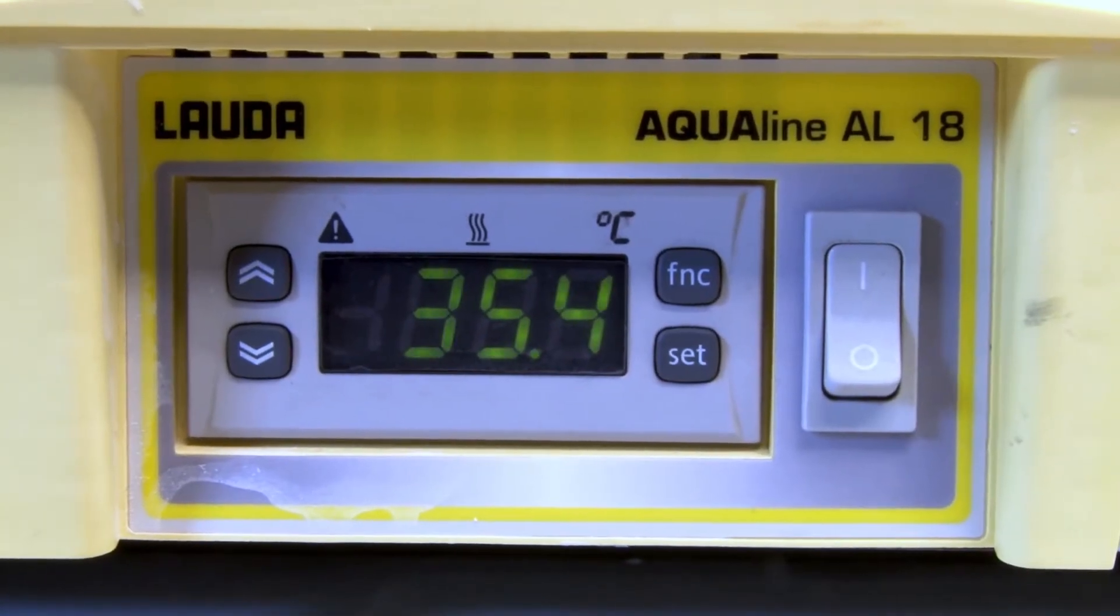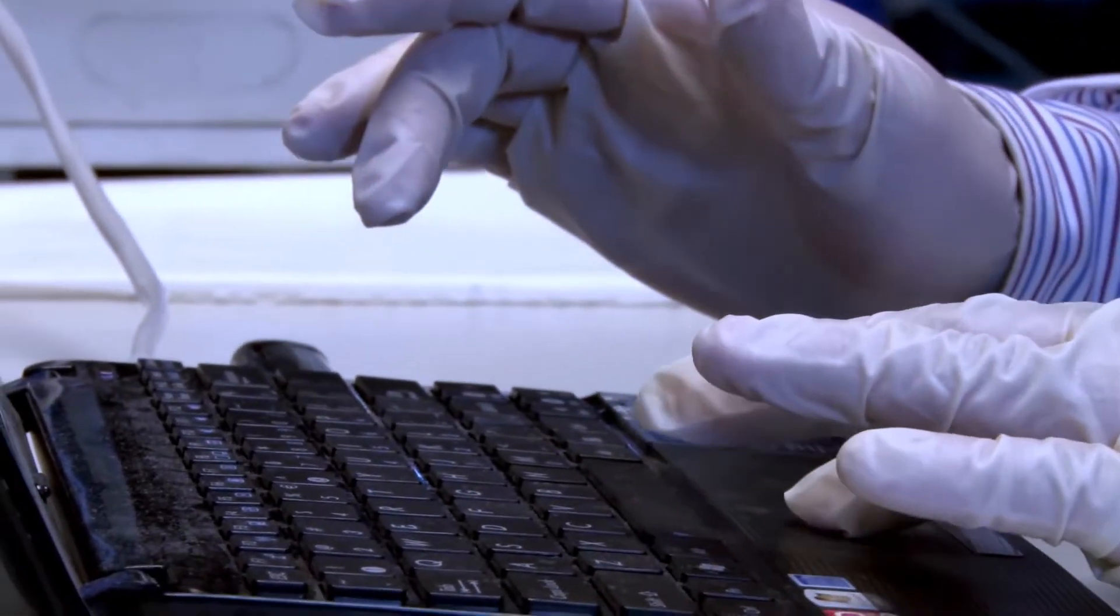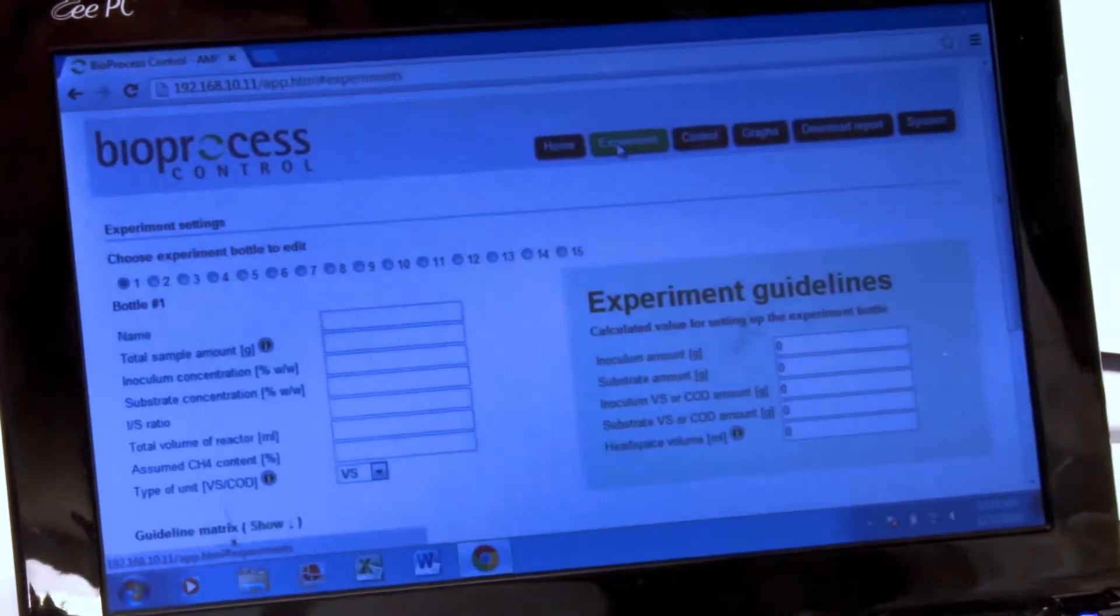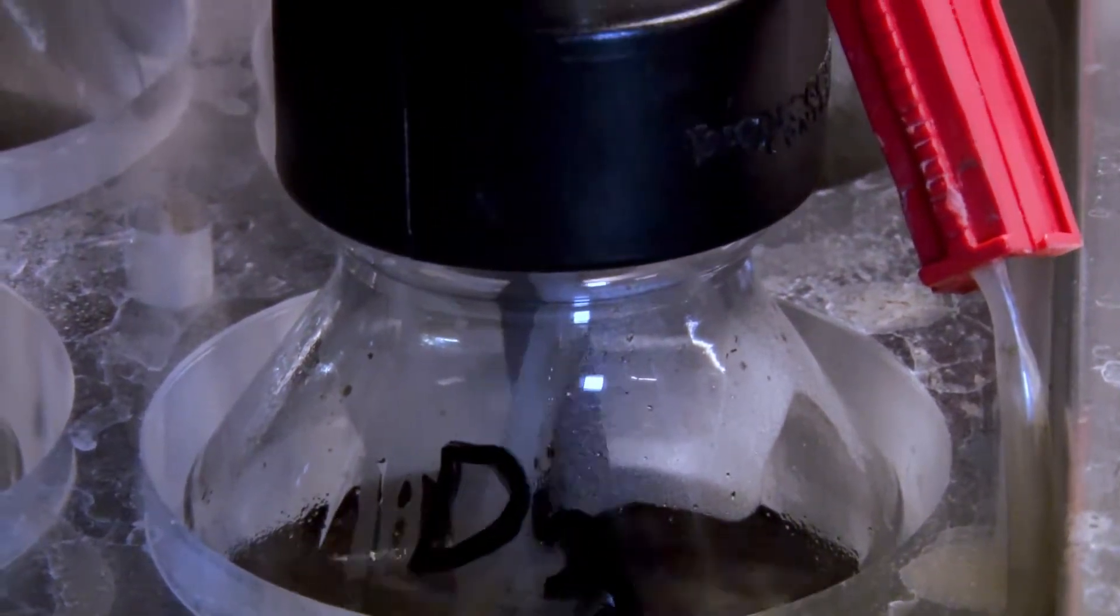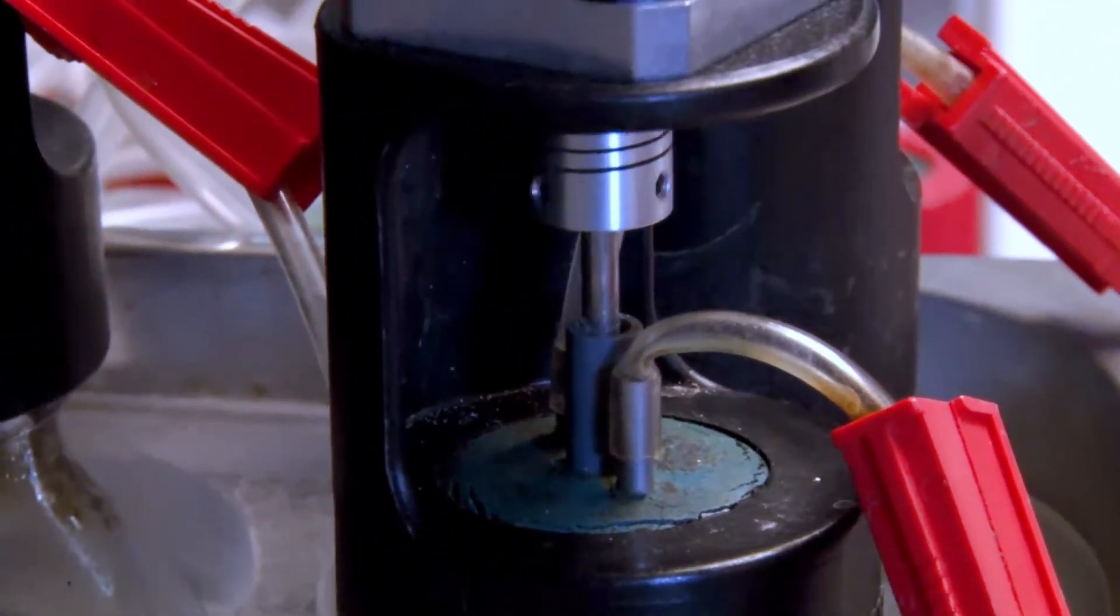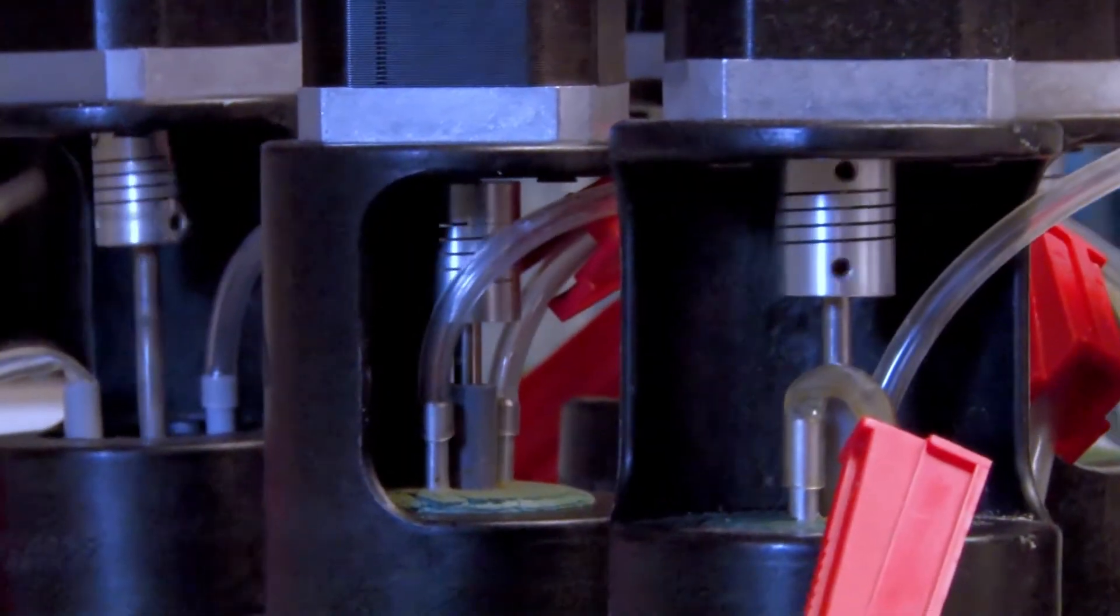Set the temperature of the water bath. In this example, a temperature of 35 degrees centigrade is used. Input the names of the samples and set the parameters, such as the COD of the substrate solution and volatile solids or volatile suspended solids of the inoculum into the program. Start the motors and the program.